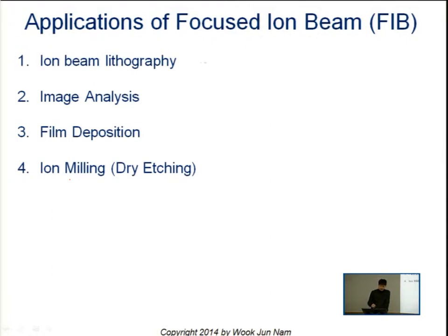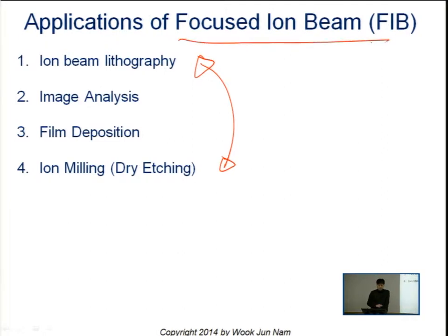So these are four major applications we can use the focused ion beam for. We already talked about ion beam lithography. Since the interaction volume with the substrate is pretty small compared to electron beam lithography, that is why ion beam lithography offers much better resolution.